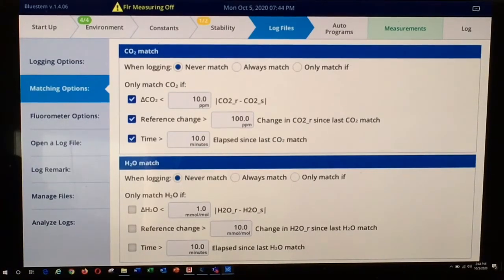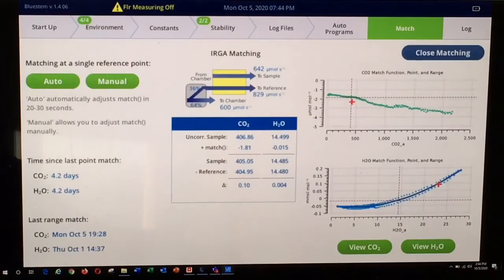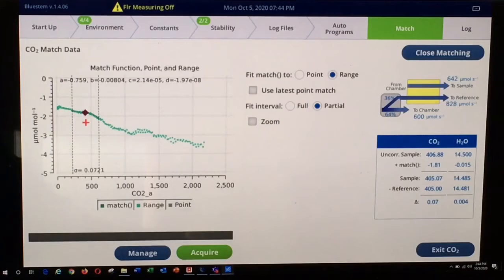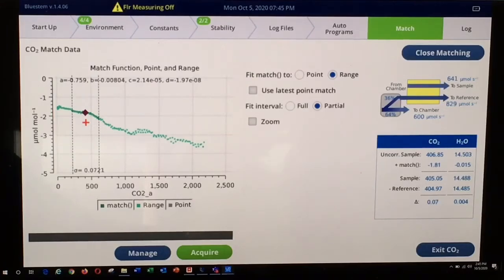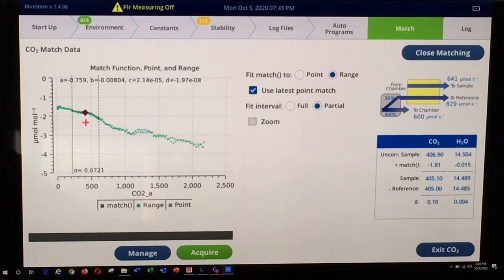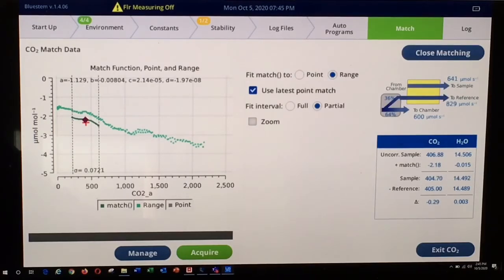To see if your curve is being altered by a point match, you can go back to the range match screen and make sure that 'use latest match point' is not checked, and that any match points you have are not pulling the curve down to a particular match point. For example, if the range match is being altered by a point match, you can see that the point match is a little ways off of the range match curve. If this occurs, you will not have as good a match between your IRGAs, so make sure this option is not checked.